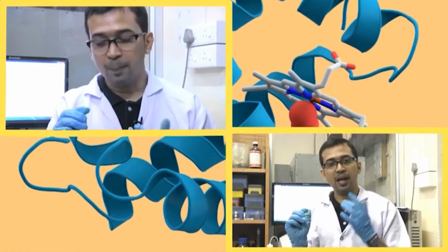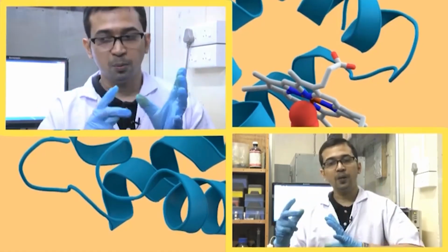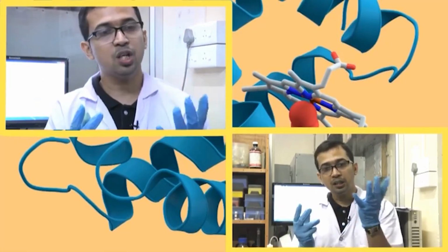Now, in the actual case, lots of rings and lots of functional moieties responsible for absorbance are attached. Suppose one ring responsible for absorbance is getting attached to the protein molecule, and the absorbance corresponding to that ring is decreasing. Several things might happen in the medium, but out here, due to this protein-ligand interaction, this is the reason the absorbance of this molecule is decreasing.